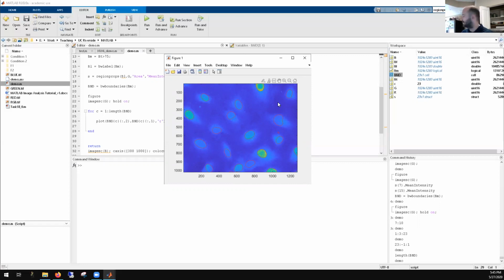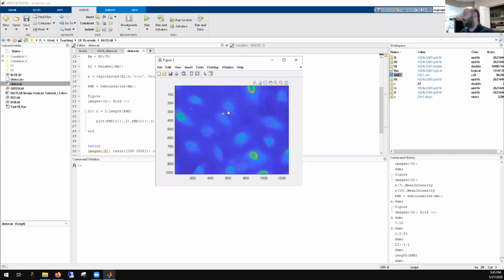So I think the last thing, and then I'll let people go to either enjoy your evening or enjoy your evening at the graduate students networking event, is how do you export this image? Let's say you wanted to save this image.